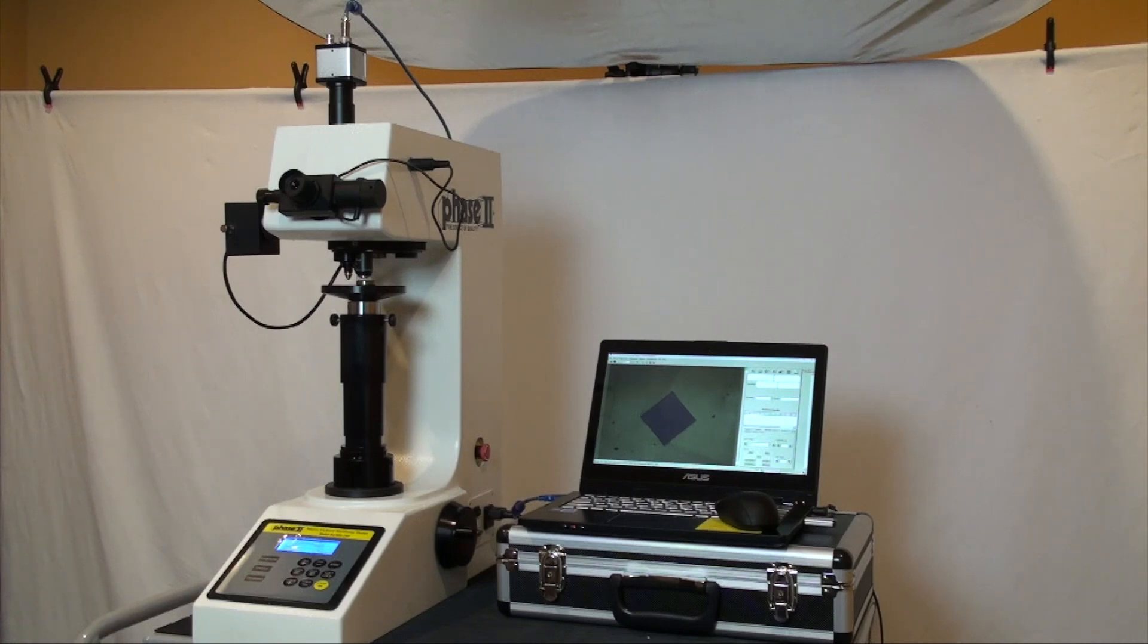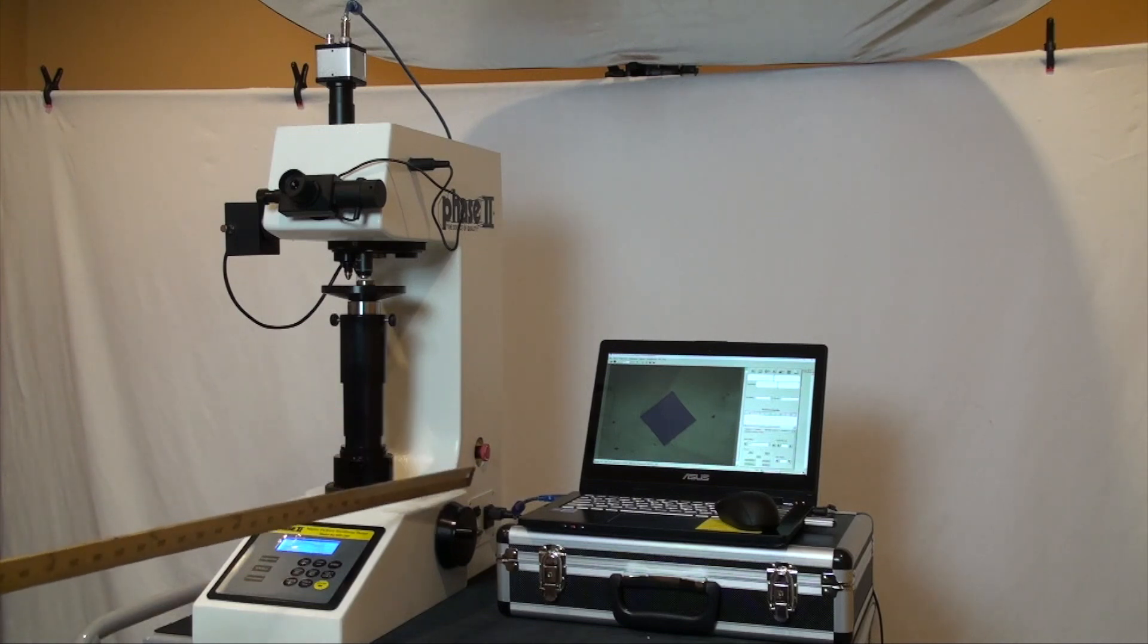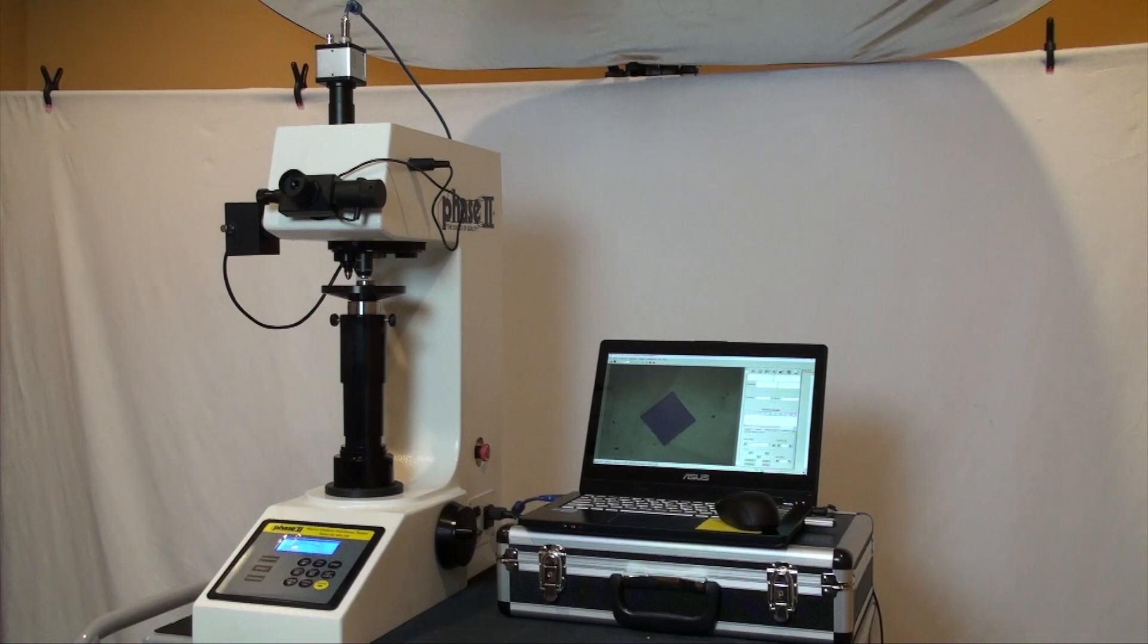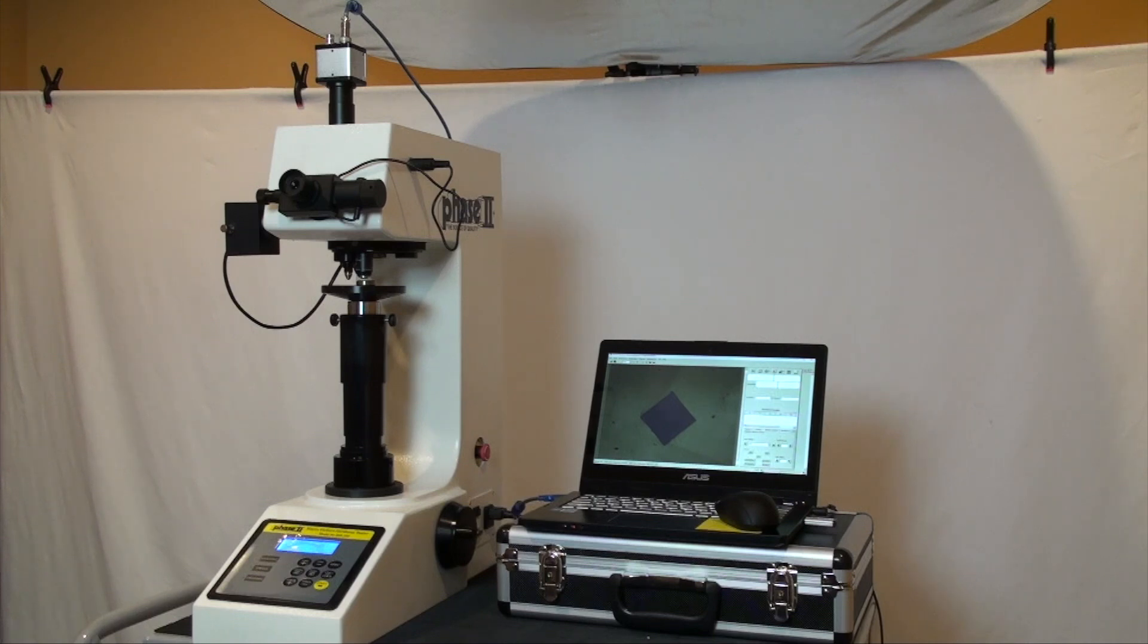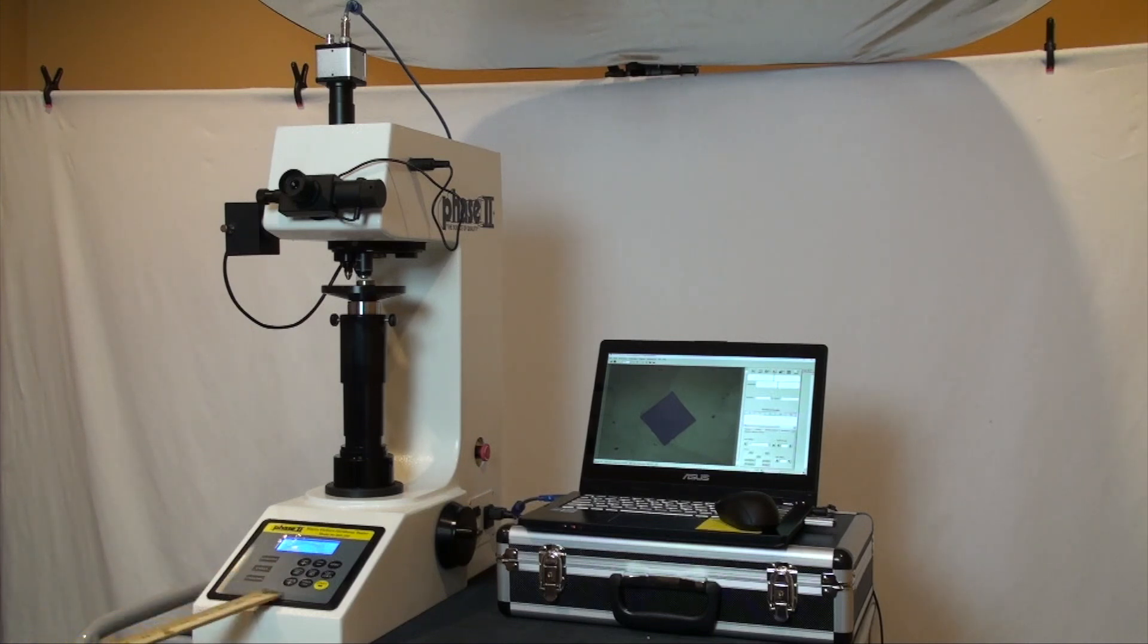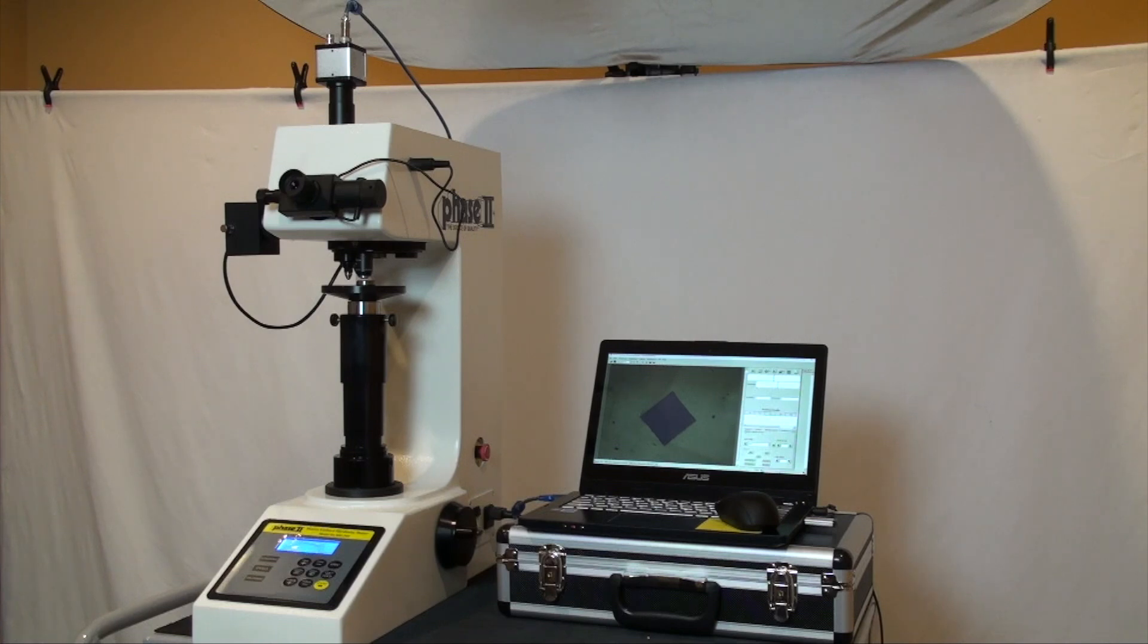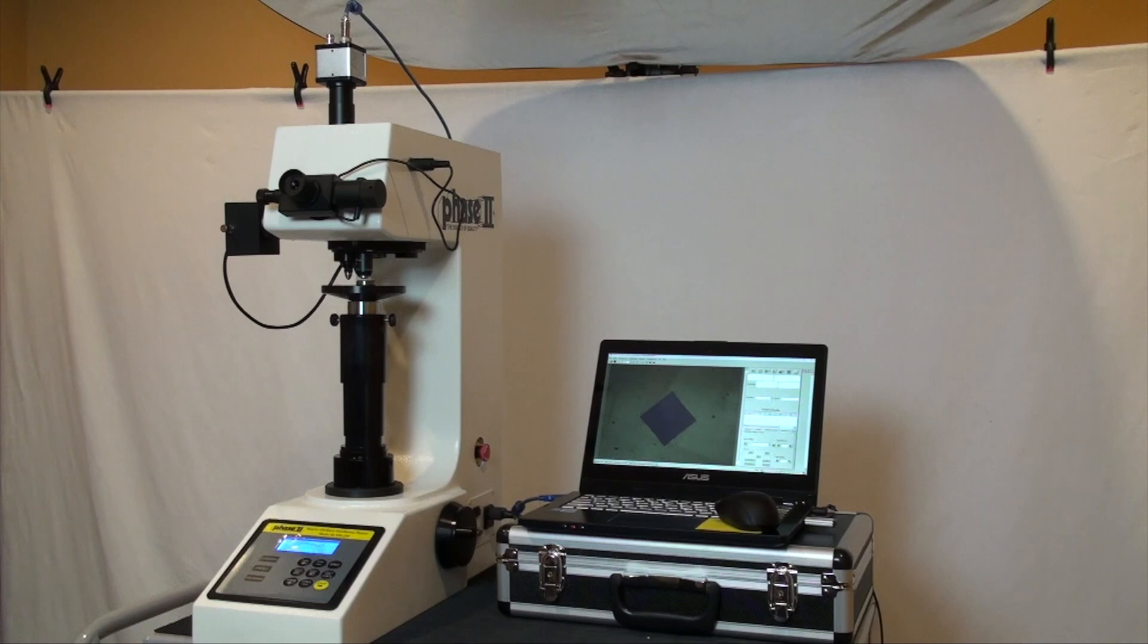Z-axis manual height and focus control. Manual turret containing both optics and the penetrator, and here is the control keypad which is mostly bypassed by the software which happens to be in complete control of the testing procedure except for the manual turret for this series 900-398.